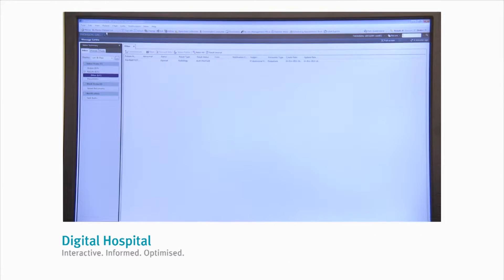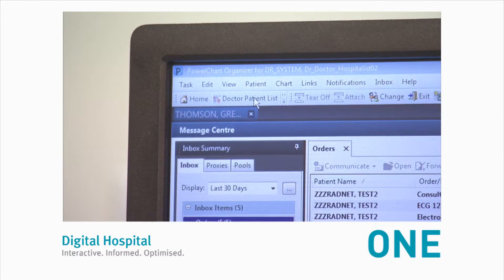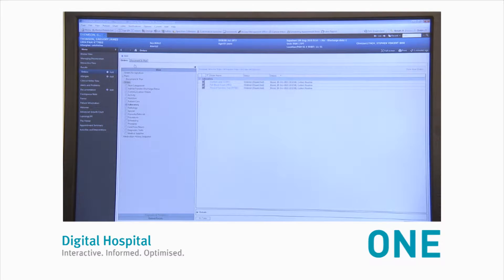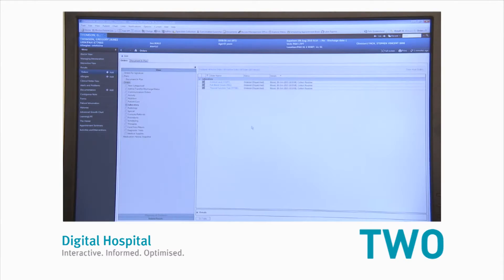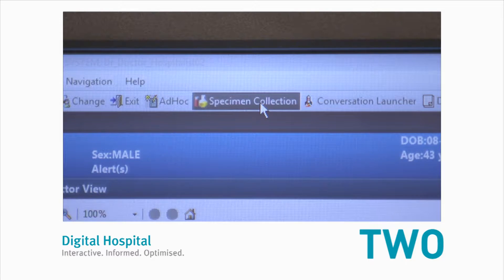The workflow for doctors to collect samples in PowerChart is: step one, select your patient either from your patient list or by entering the UR number in the search field. Step two, select the specimen collection icon from the top of the screen.